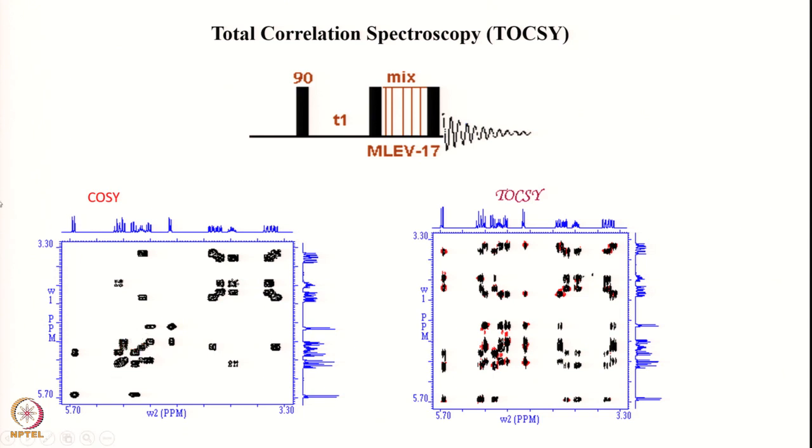So this is how we analyze the COSY spectrum. Analysis of the COSY spectrum in a complex system. See, you could not identify this from the one dimensional spectrum. This one dimensional spectrum would not allow you to identify all these correlations. Which proton is coupled to which proton? Both of these are proton spectra, okay. Along both axes we have the proton frequencies. So from the one dimensional spectrum, you cannot figure out which one is coupled to what.